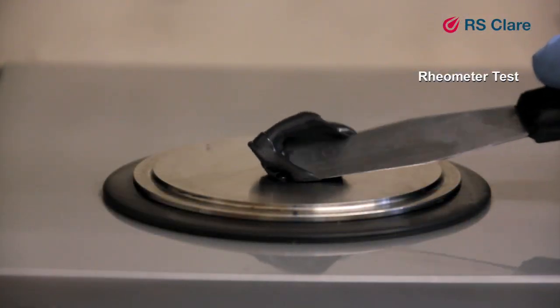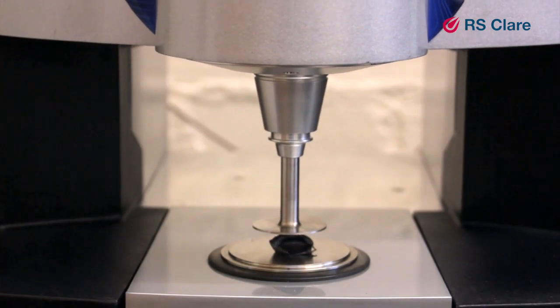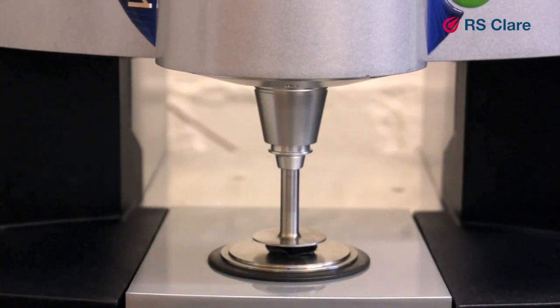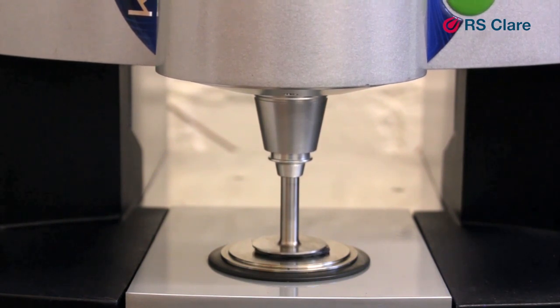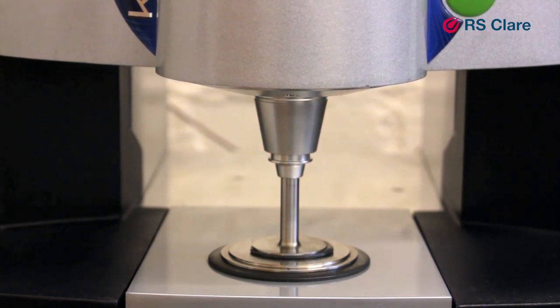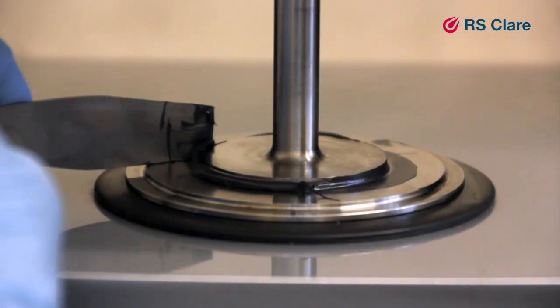First of all, the grease is loaded onto the bottom plate. Then the circular disc, called the cone, is lowered down towards the plate. The distance between the cone and the plate is set to 0.15mm. The excess grease is removed.